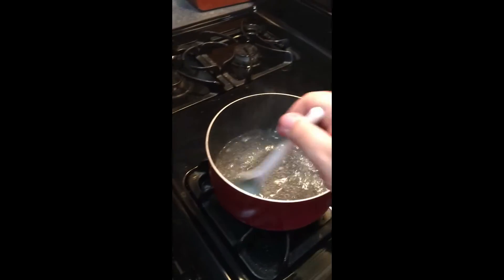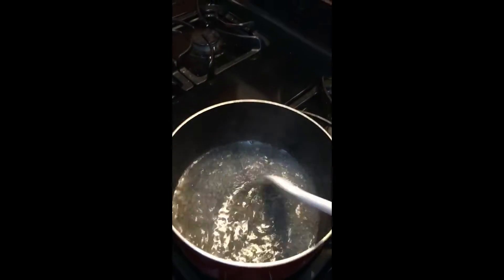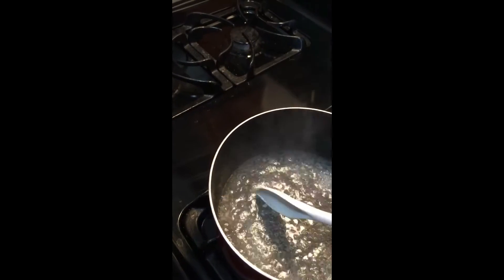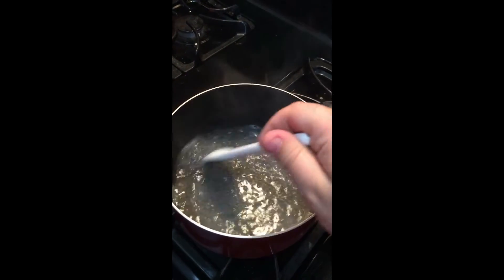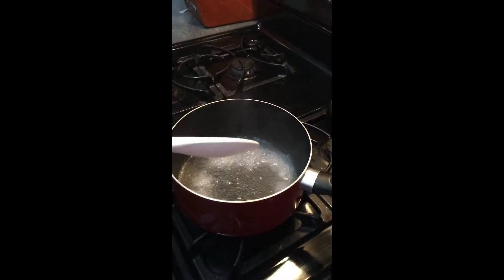We want to make sure we boil it enough — that's what the directions say. We want to make sure it gets boiled enough. Be careful of the steam; the steam can burn you. We want to make sure that all of the agar mixture is dissolved.